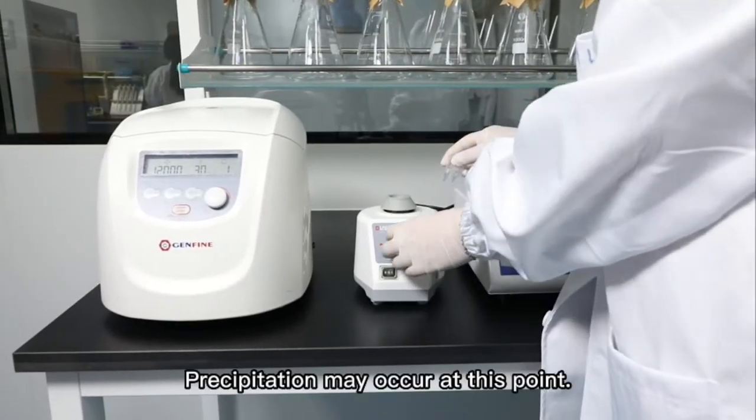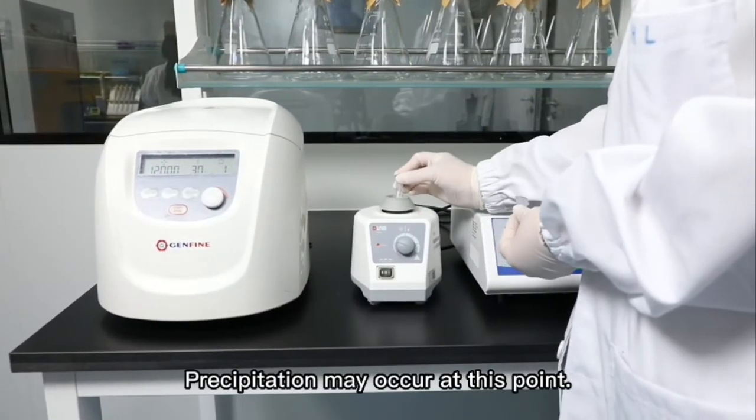Mix well. Precipitation may occur at this point.